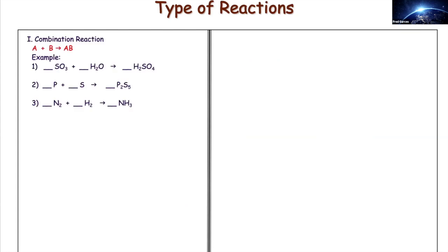So these are the different types of reaction that you guys are going to be studying. You guys are going to be studying the combination reaction. This is where two chemicals become one. And you guys have a pre-lab question where you're supposed to recognize what the reaction types are. Is it coming together, or is it breaking apart? Is it a single displacement? Is it a double displacement? And again, for those of you in my class, we covered this already back in chapter 7. So look at your notes, but here I'm going to reiterate it as well. Combination reactions are reactions in which two or more chemicals form one. So they're combining.